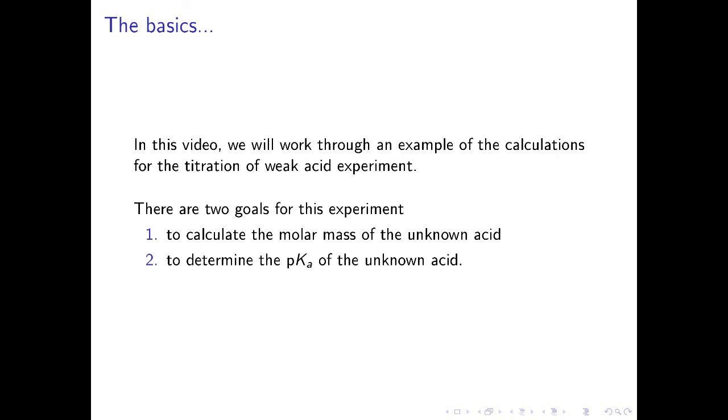We have two goals for this experiment. First, we want to calculate the molar mass of the unknown acid. Second, we want to determine the pKa of the unknown acid.